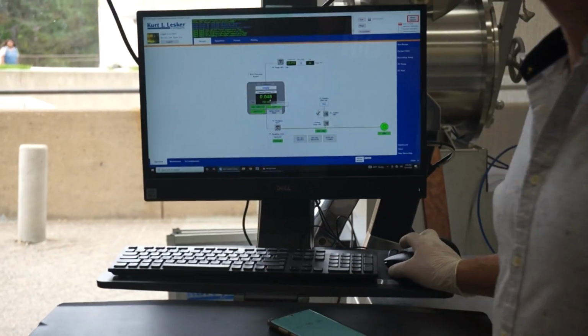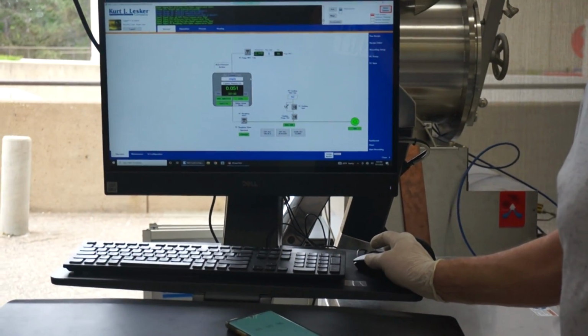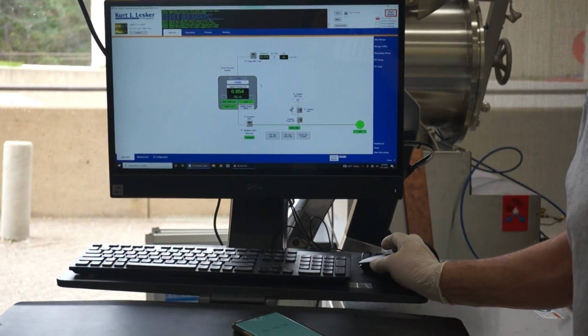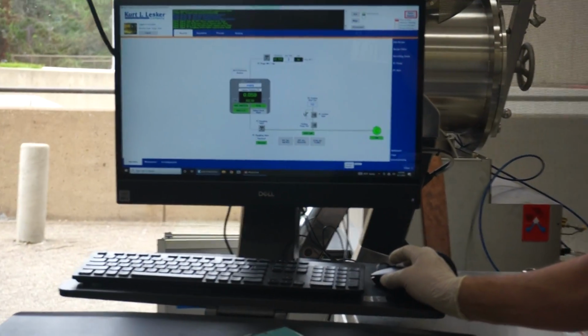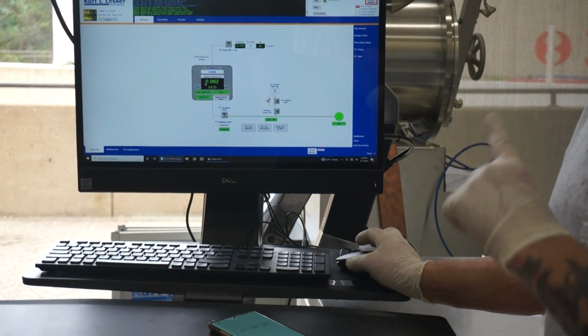So that was 40 seconds. So it's getting better. We didn't make it better by putting that on. It's just conditioning. But it's not greater than 50. So we have some confidence that we have a good seal there. And we have to do the same thing to the TMA.